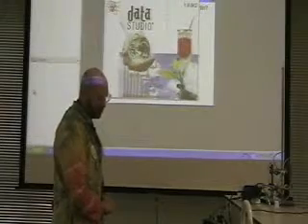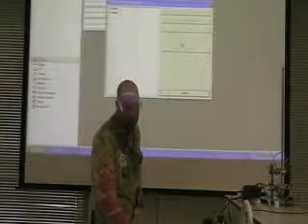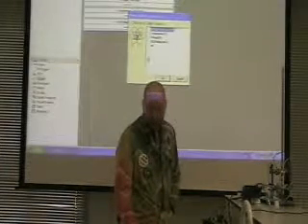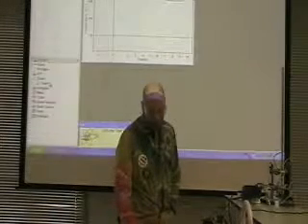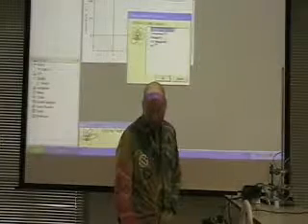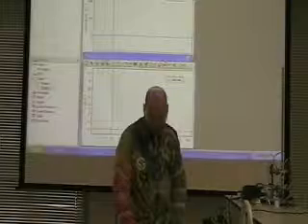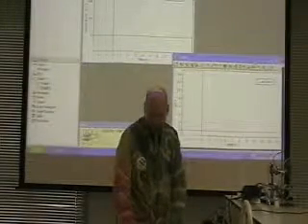Fire up Data Studio again, because I've changed probes. And it will give me that string. Now, I'm not interested in all of that stuff. I am interested in graphs, though. I can choose what I want. I want temperature graph, and I also want pH graph. And I can pull them apart so that I can see them one below the other and how they change with each other.